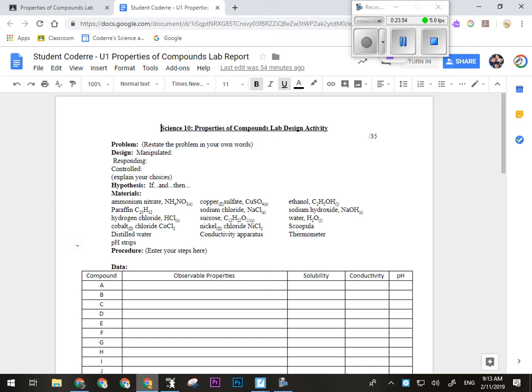Then I would say you take it back to your table and you do which test? The observable properties test. Now's the time to do the observable properties. Can't do it after you add water to everything. So now's the time. When you're telling them how, you don't just write down step 3, do the observable properties test. They're not going to know what that is. That's not an idiot-proof experiment. It needs to be explicit. Performing the observable properties test means tell them you're looking for these things.